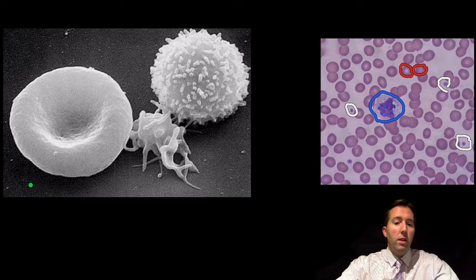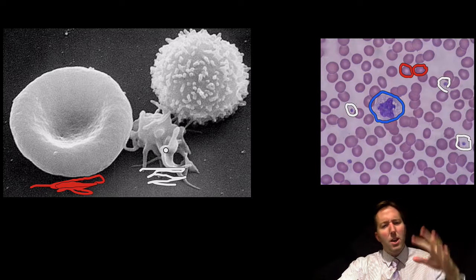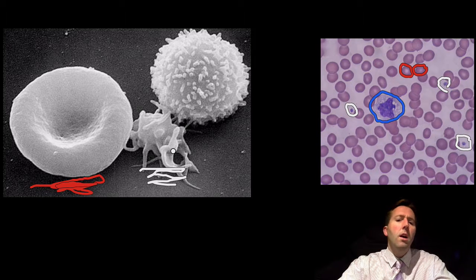So this is a red blood cell. Make it red. This one's a red blood cell. You can seriously see this dent here. Really clear image of the cell and the shape of the cell. Over here this is a platelet. So this is what a platelet looks like, really up close. Looks so different to the light microscope picture. You can see such amazing detail. These kind of funny filaments coming off the cell, and that would help it clot.